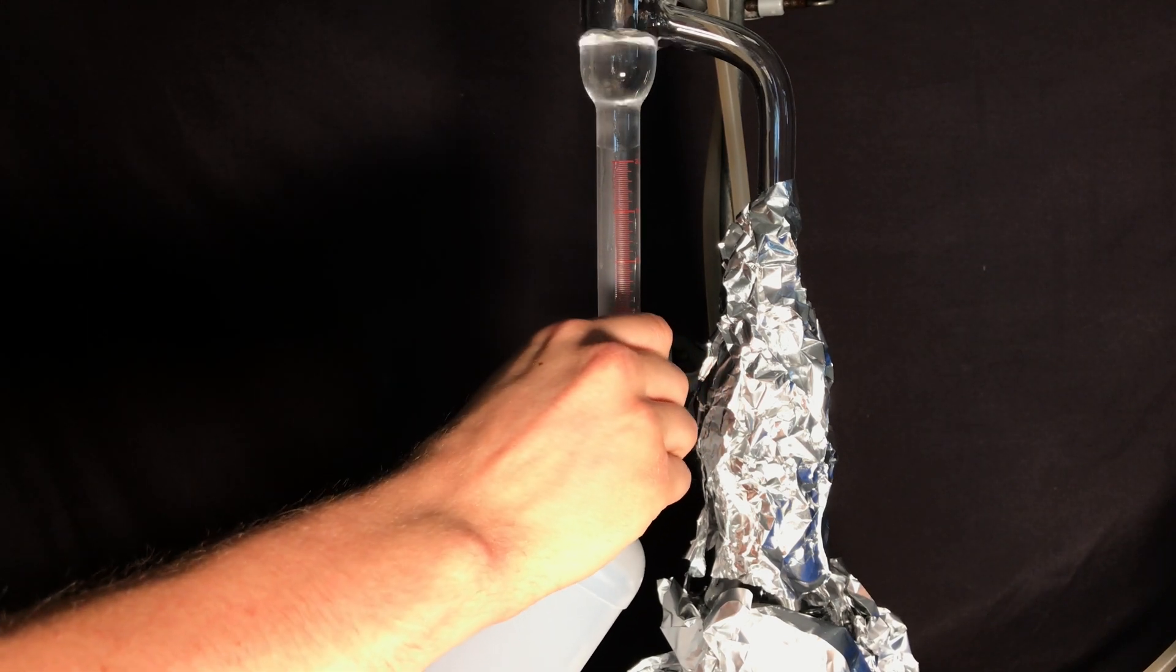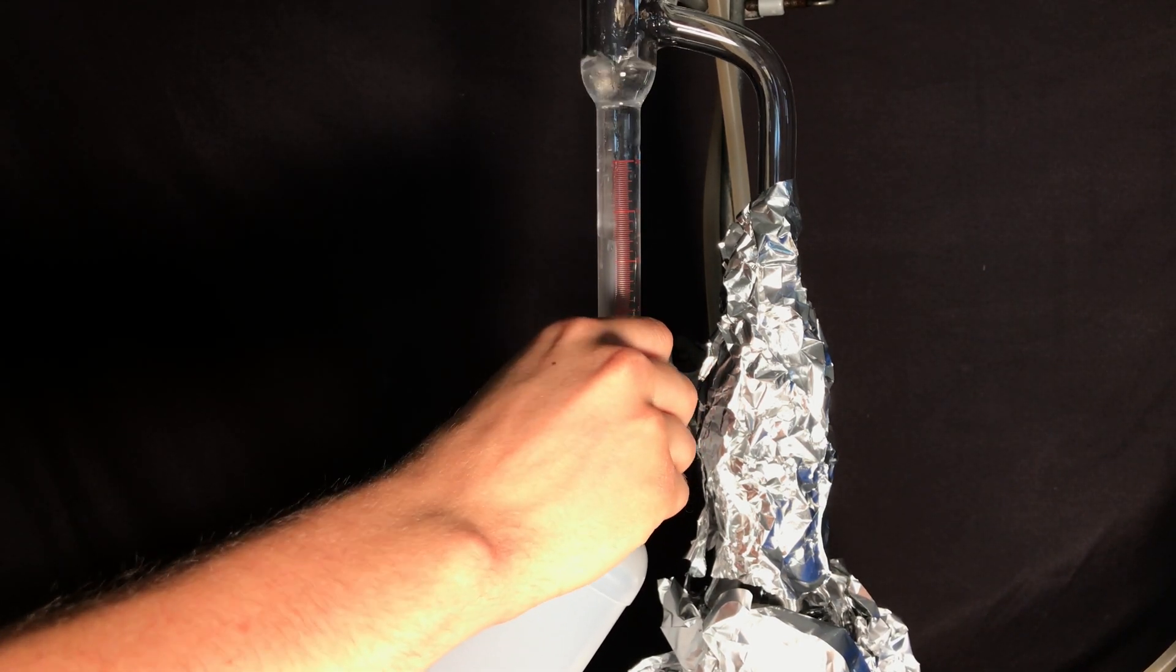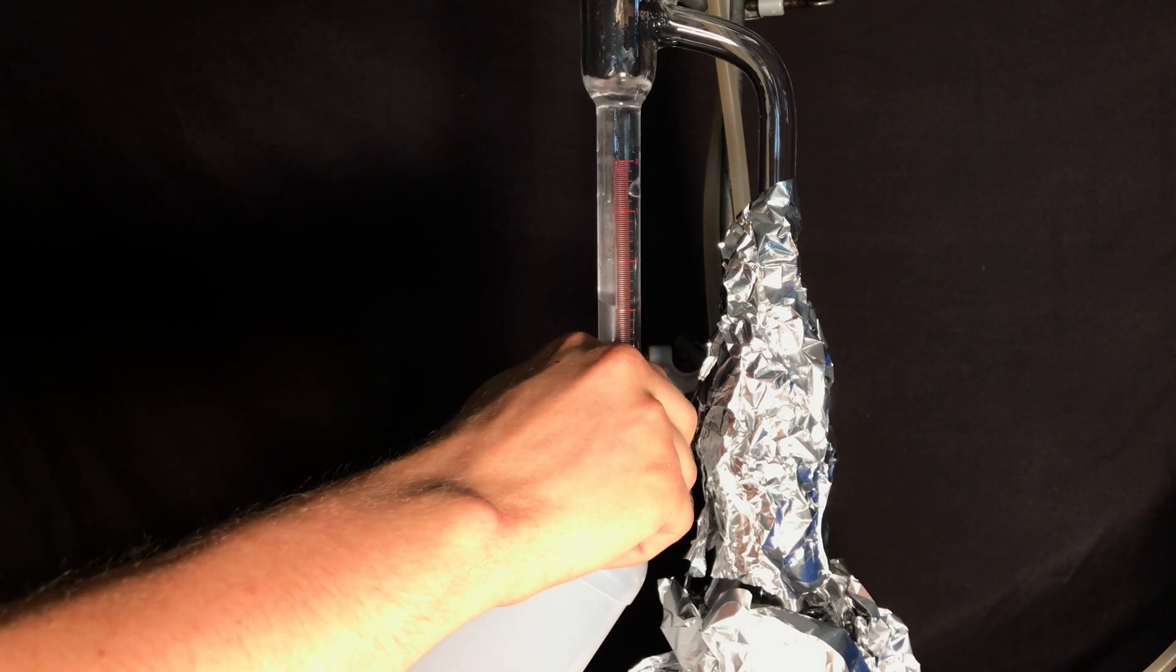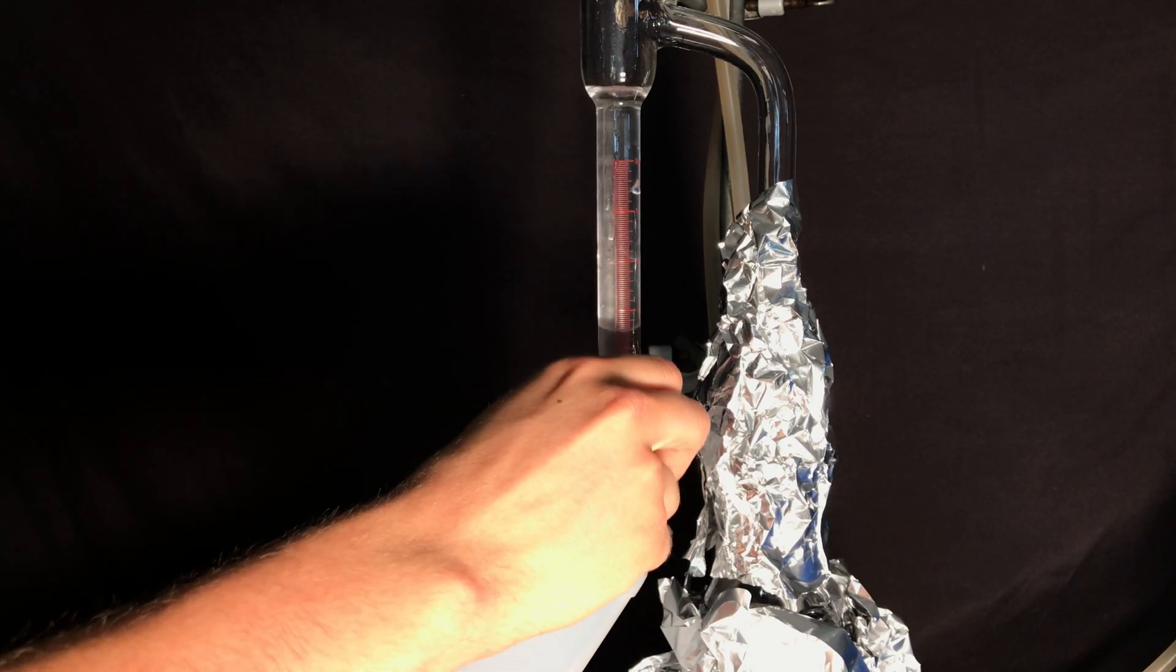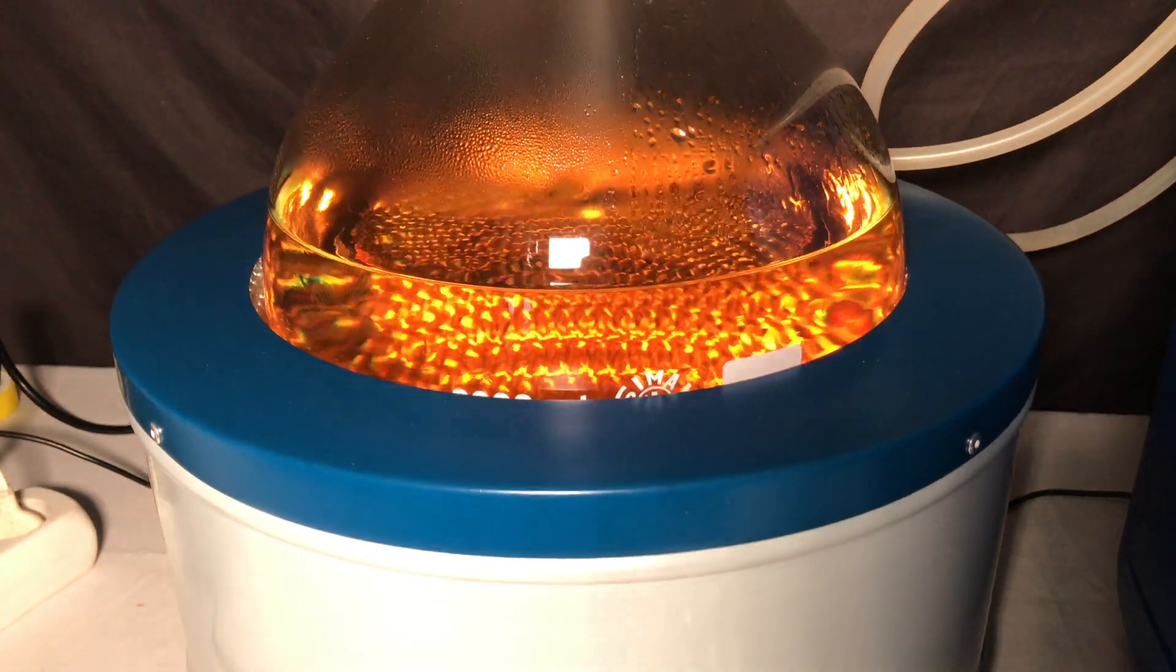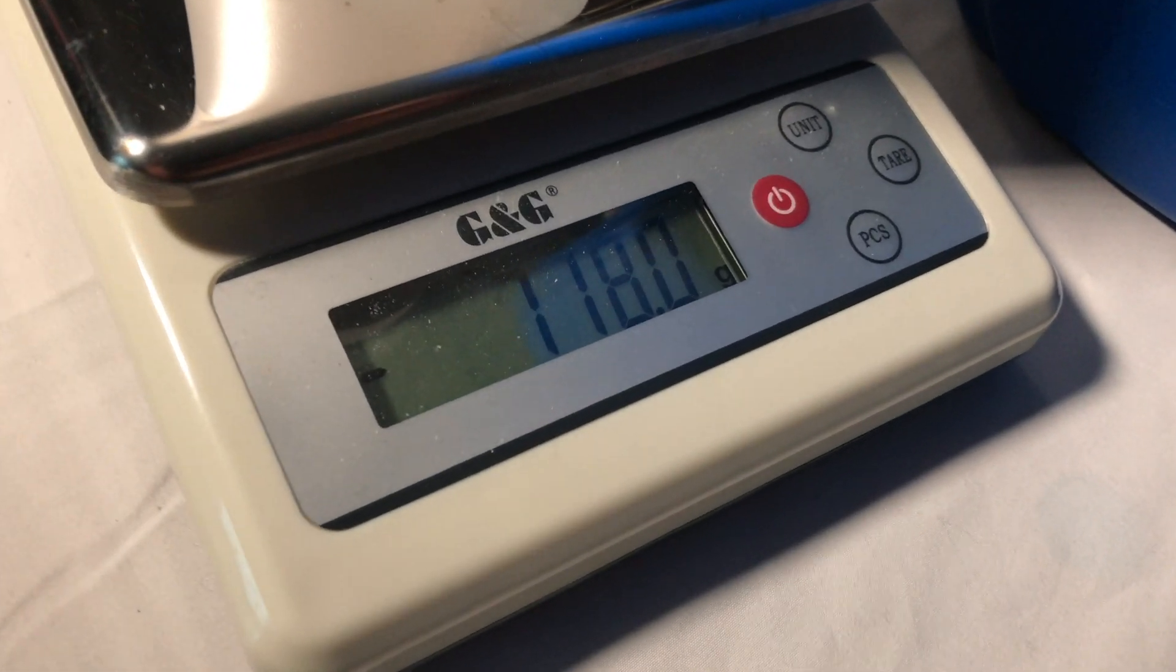Under ideal conditions we would collect 414.35g of water and my Dean-Stark trap is not going to fit that much. Therefore we occasionally had to drain it. I used this pre-weighed storage bottle in order to determine how much water we already collected.